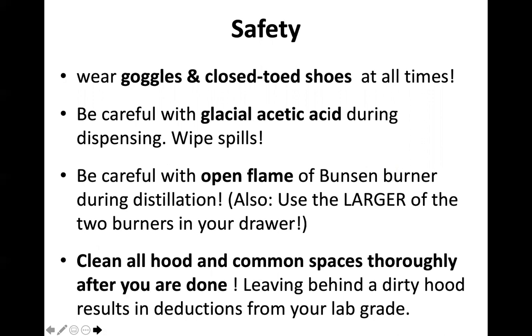Once you're done, please clean up your hood and all the common spaces, including anything around the scales and everything, thoroughly, so that we leave behind a clean and a safe lab environment for the next group to come in.